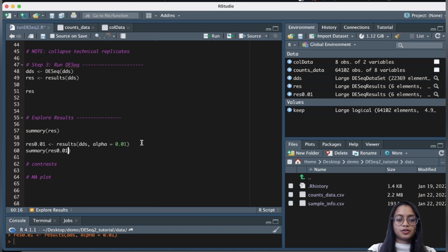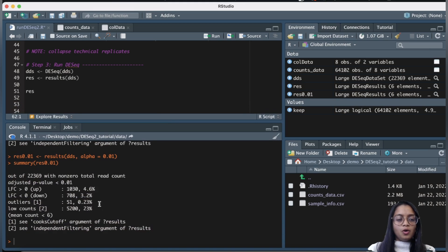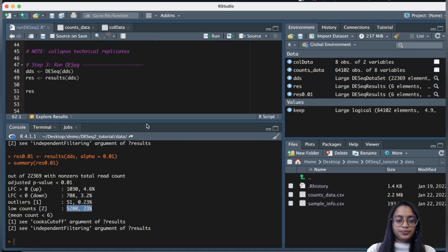With the adjusted p-value threshold of less than 0.01, we get different numbers of upregulated genes, downregulated genes, outliers, and genes with low counts.